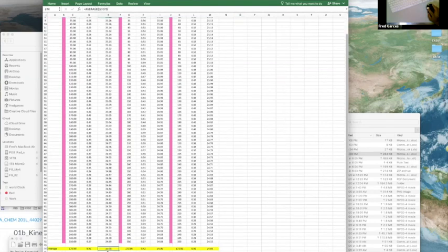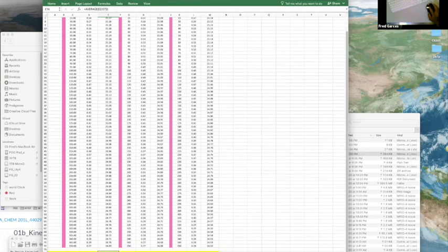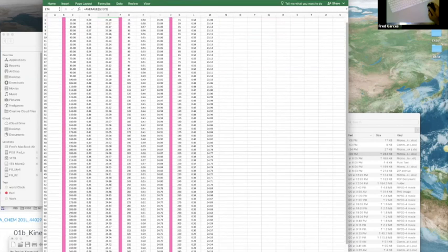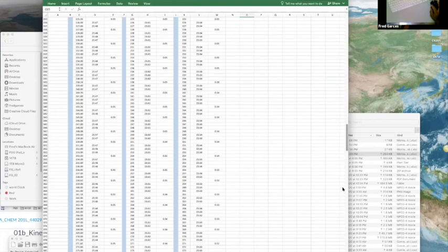The average temperature, as this experiment was running, actually started at 25.29 and cooled down to 24.69, but the average was 25.03. The second trial started at 25.1 but ended up at 24.68, and the average was 24.9. So each one of these has a temperature average at the bottom, and it's still considered for the 3 trials.